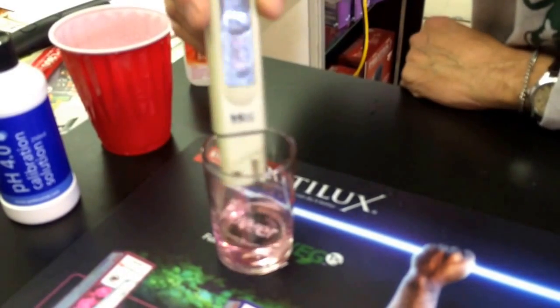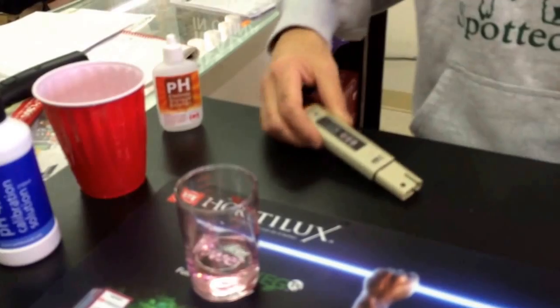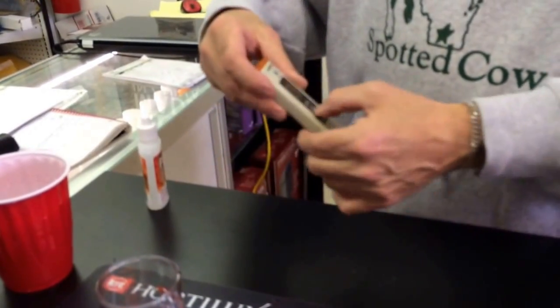All right, it's all done. Now it's properly calibrated. I would rinse it off with a little bit of tap water, take your storage cap with the sponge in it, put a couple drops in the sponge, then put it on, and you're all set.